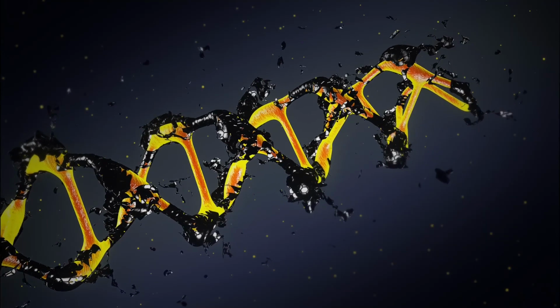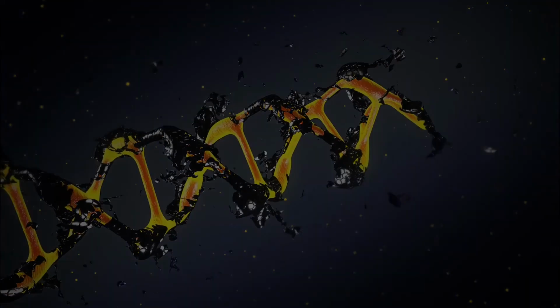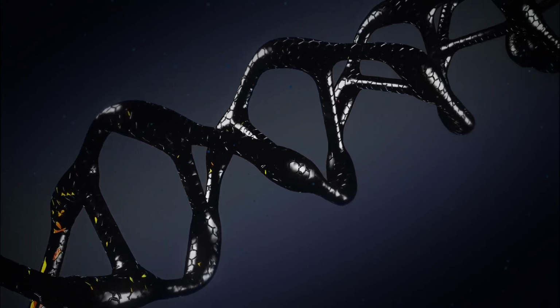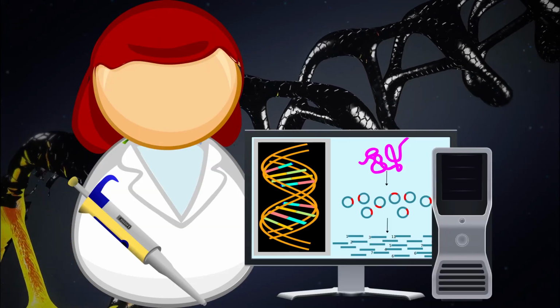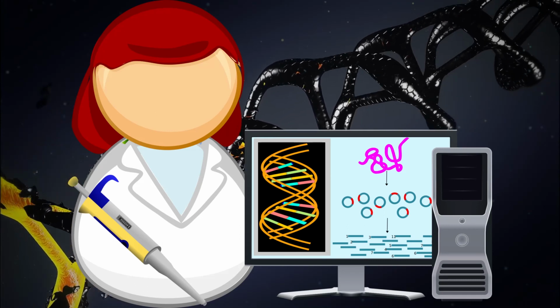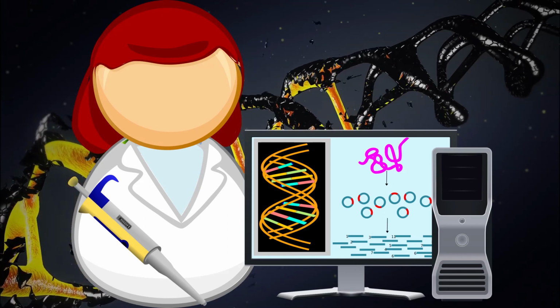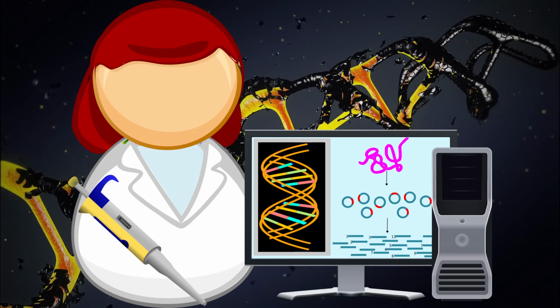It allows you to randomly select a series of DNA sequences from in there using that primer, separate it in the gel and compare the two gels, which should read somewhat similar to a barcode. The reason the arbitrarily primed PCR is reliable and replicable is that it should bind to the best match in the genome. This means that you should be able to take the same sample, run the same reaction again, and be able to see the same results.